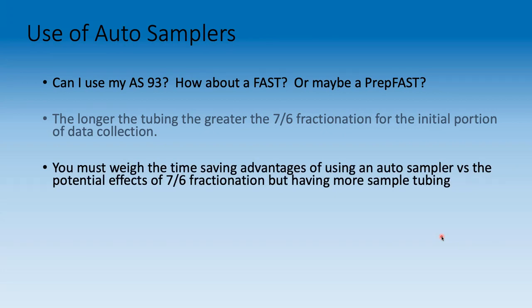You've got to weigh the time-saving advantages of using the autosampler against the effects of fractionation and having that longer sample tubing and having that automation. It's not something we did. It's not something I even wanted to try, given the way our setup is. But please, by all means, in your lab, go try it. Let me know. I'd love to hear what your results are.